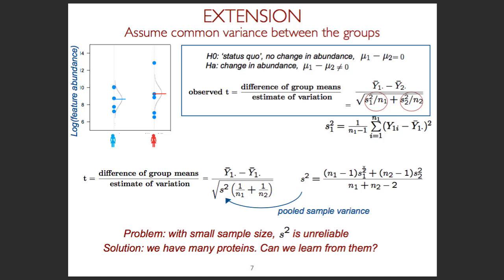So yes, the answer is that if you have time course or paired experiments, you're much better off analyzing this as such. And this is, again, what MSstats would do. In fact, we call it time course, but a paired design fits the same model as the time course. And MSstats would recognize this by seeing that you have the same identifier of biological replicate in multiple groups. You have healthy and disease, and you see it's the same person in the two, and MSstats will fit the right model for that. And in LIMMA, you'll have to set it up in a more complicated way. You have to specify a little bit how it works.